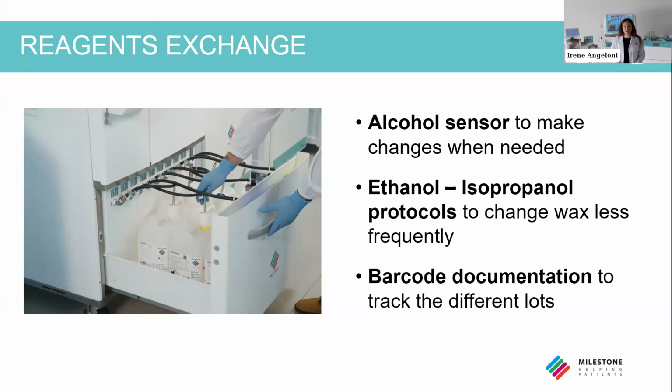Why this? Because in this way, I will have the information on the lot, on the reagent, also when required if facing some problems. So also this is important.